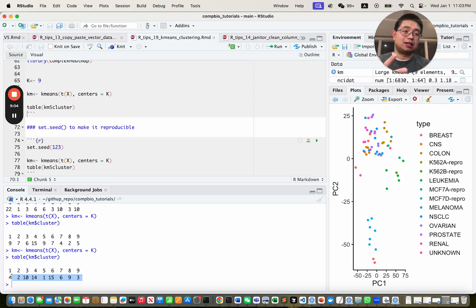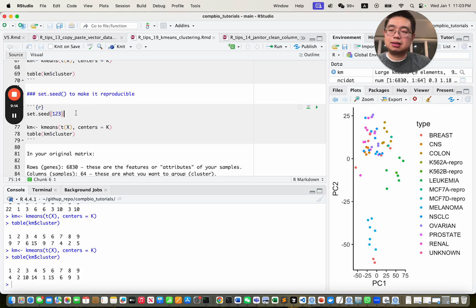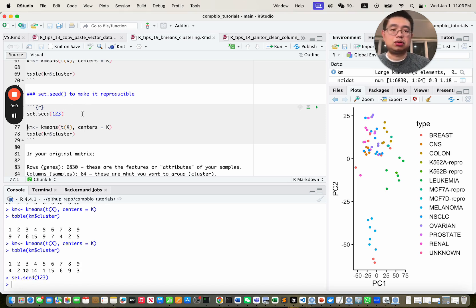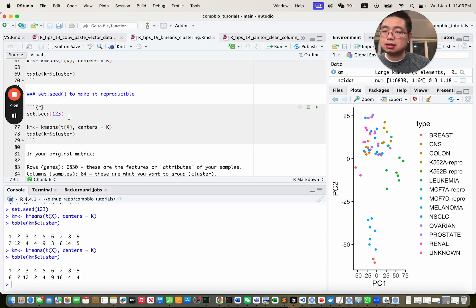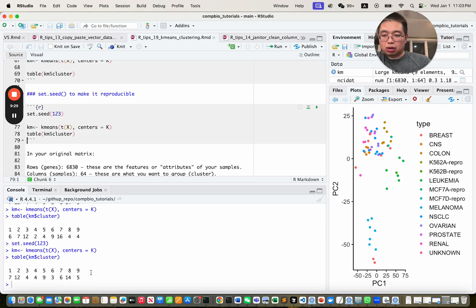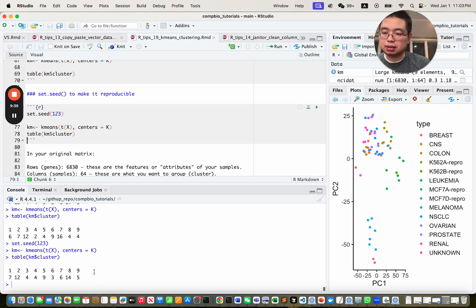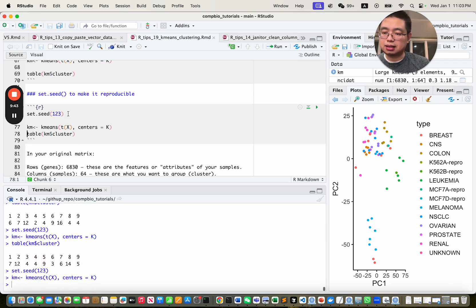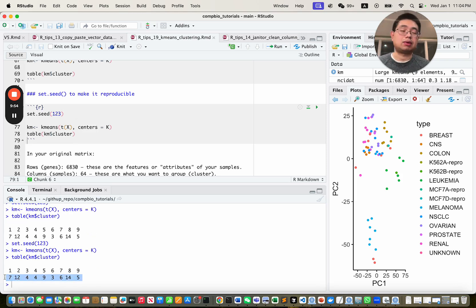When it initializes the initial centroid points, the result varies. So to make sure it's reproducible, use set.seed and set any number. After doing this and running k-means again, it should always give you the same results. That's why you need to set that seed.